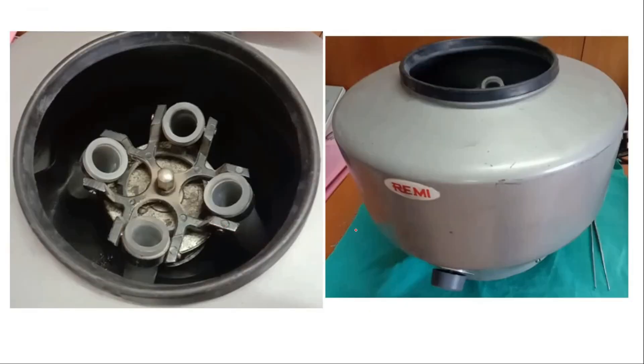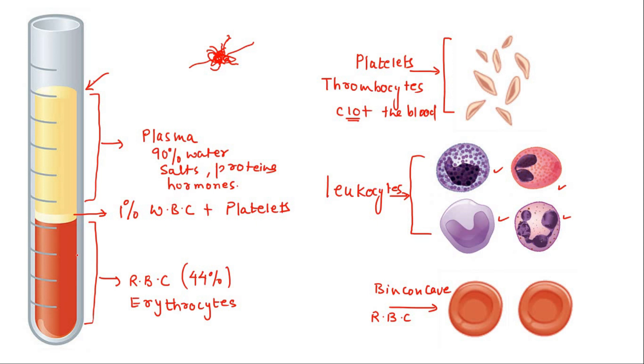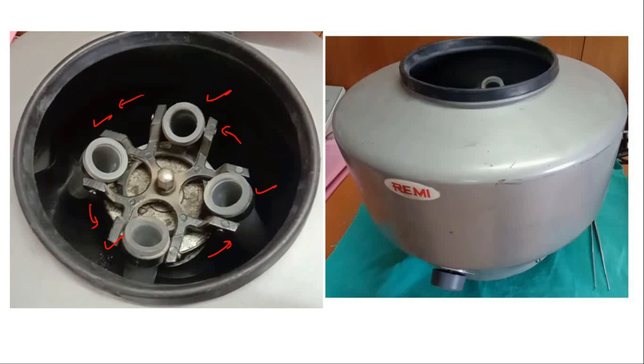This is the centrifugation machine used in this demonstration. It has four slots for test tubes. Human blood is poured into these test tubes, the mouth is tightly shut, and when we switch on the machine, the test tubes rotate very fast. Due to this, the high-density particles — the red blood cells — settle at the bottom, and the lighter particles remain at the top. We are going to keep the speed at about 1000 rotations per minute for the centrifugation process.